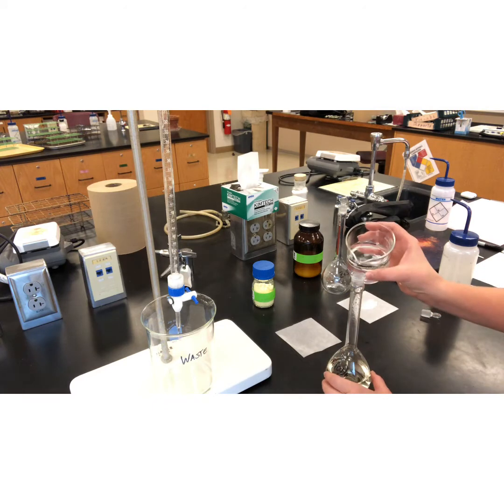All right, I'm going to very carefully continue to add my DI water until I start to get close to the neck. And then I'm going to start to add it dropwise.